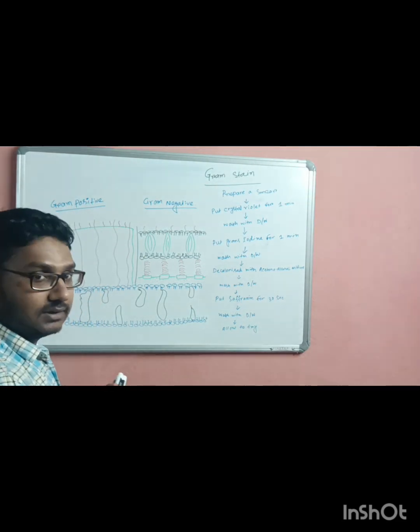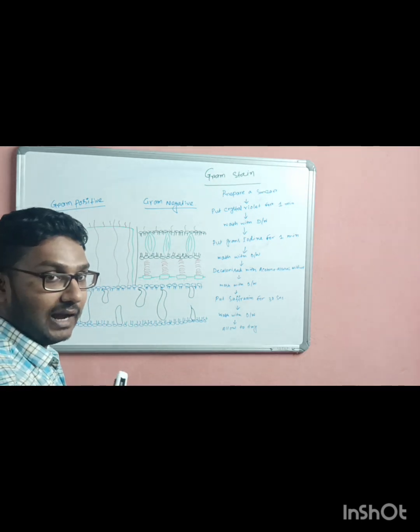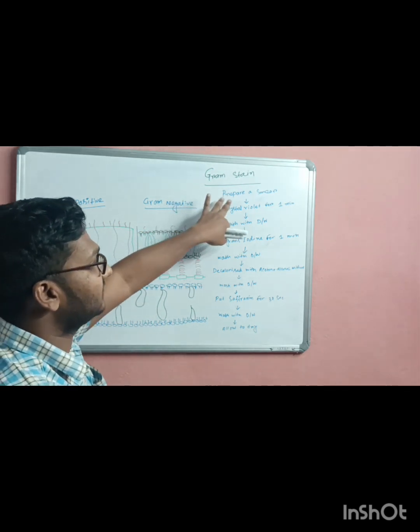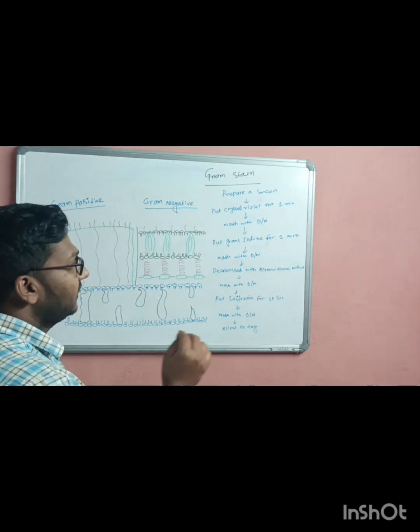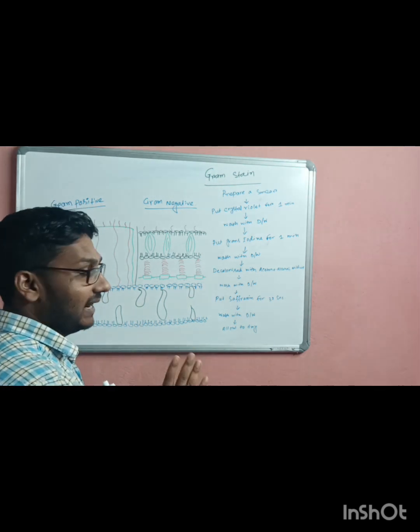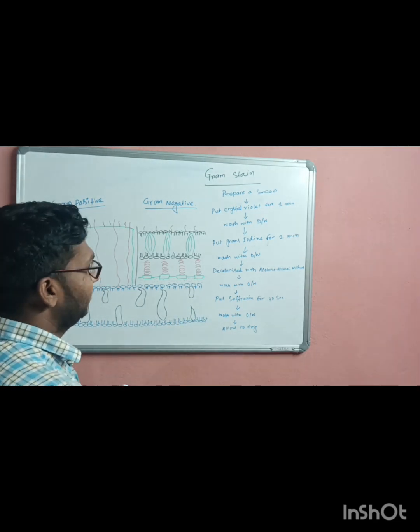I will show practically how we prepare a smear. Then we put crystal violet solution over the smear area and allow it to hold for 1 minute.